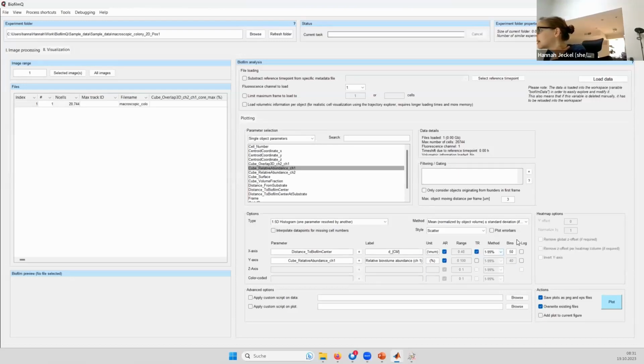And in our particular case, this is quite useful because then we don't need to worry so much about what we want the axis to be, like we would need to look up how big the biofilm is and everything. Just basically the axis range. So we just set it to 1 to 99, and this is probably going to be fine. We can also set it to min-max.